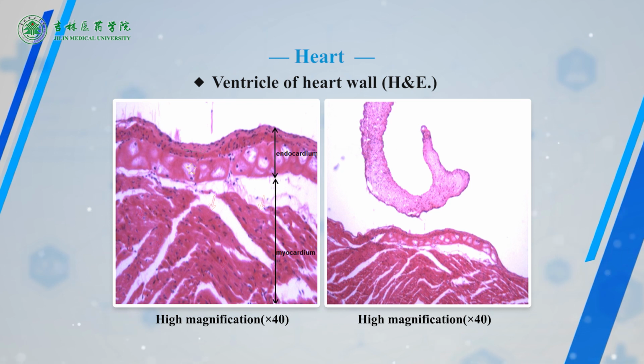The even outside surface, stained weakly, is the epicardium. Epicardium is slightly thicker than the endocardium and consists of connective tissue, which contains blood vessels, nerves, and lymphatic vessels of the pericardium, but sometimes has dropped off.